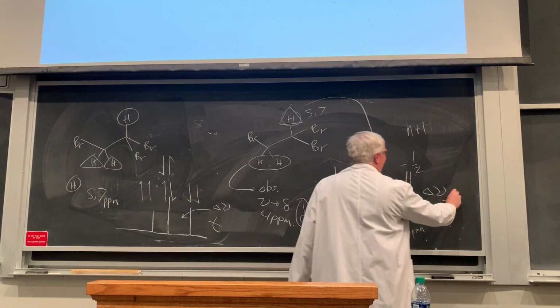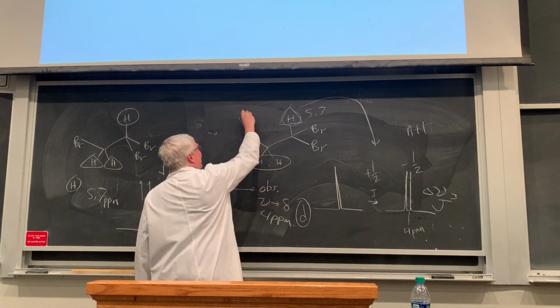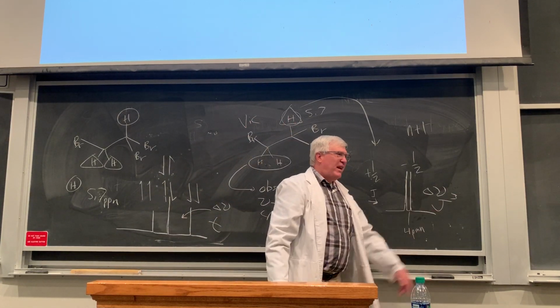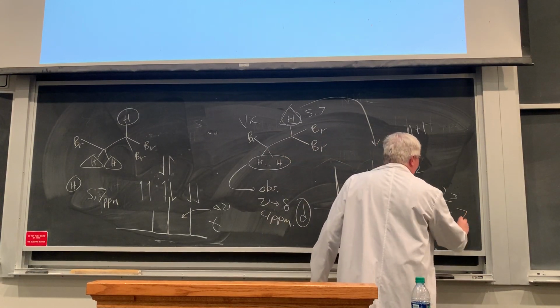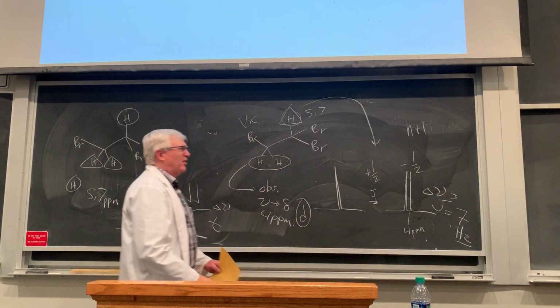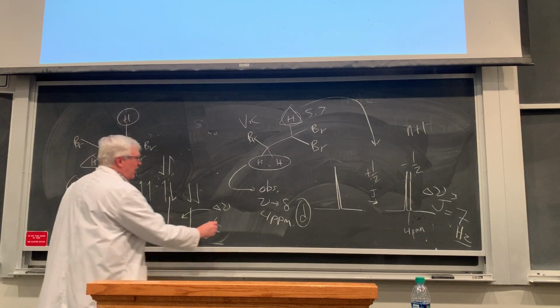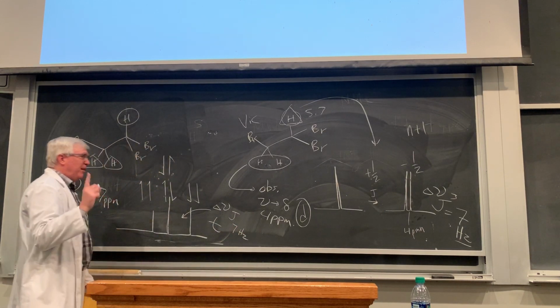And it's usually a J3 value for most molecules where we're looking at this vicinal relationship. Notice there's 1, 2, 3 bonds intervening there. That's why it's J3 type coupling. And that's very typical for vicinal neighbors. And it's typically about 7 hertz, okay? That's kind of the average. It's not very much, it's a tiny amount. Remember, these are the extra little magnets. So this difference here would be this J value of about 7 hertz. Okay, but we can see it.